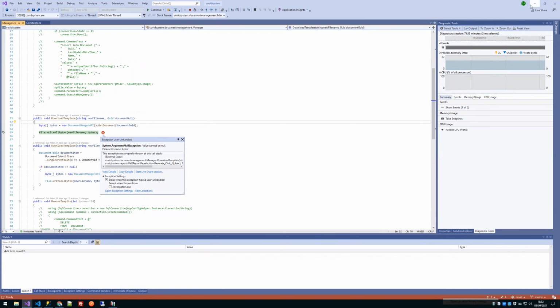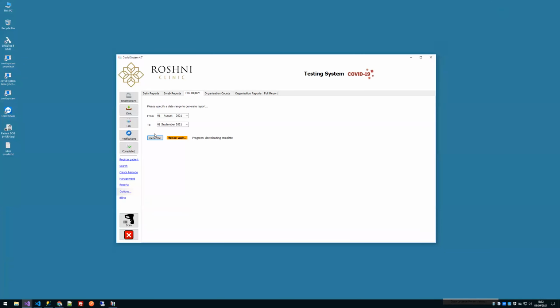Okay, I've not got the certificates in there. I've not uploaded the PHE template. I just knocked this up this afternoon. I can show you on a live system. This is recorded in last day's data as well, so probably won't do that. But ultimately, there is the template. Let's see if I've got one here.